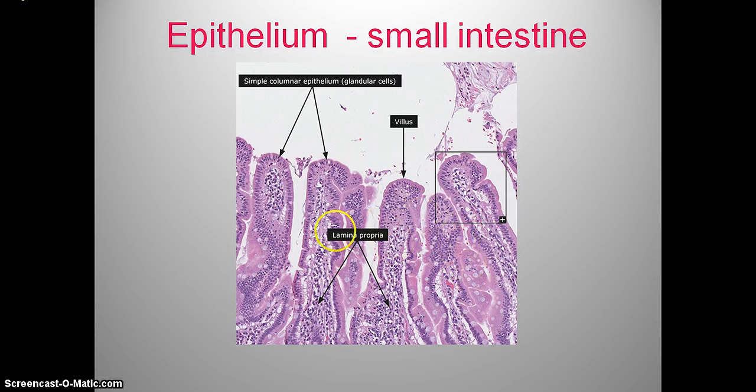And notice the small cells right here. Notice how they have kind of shape of the column. They're elongated, and those circles are nothing else but nuclei. Look, elongated shape, and nucleus is kind of at the bottom of the cell.